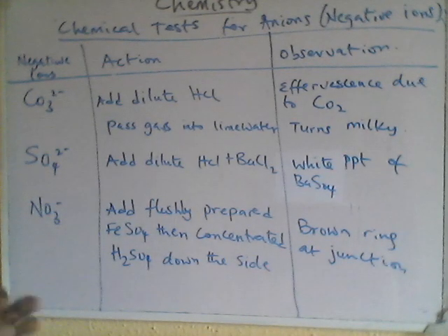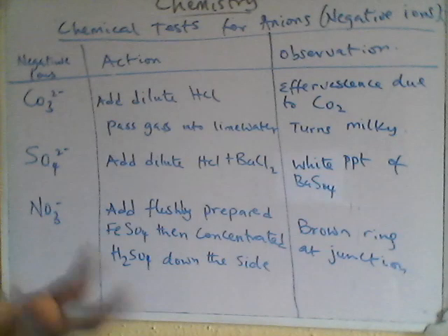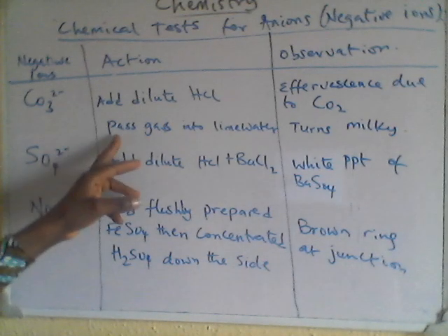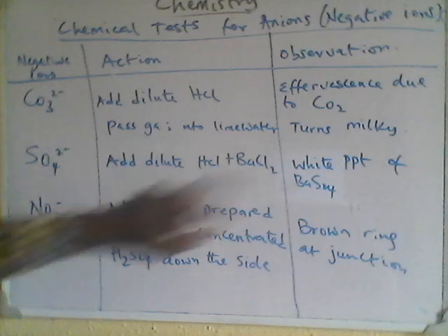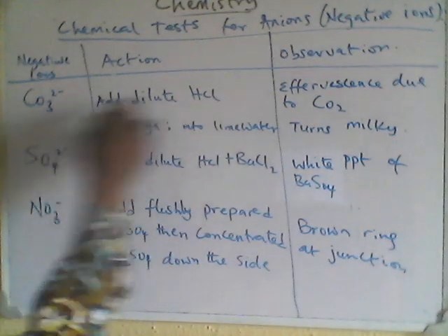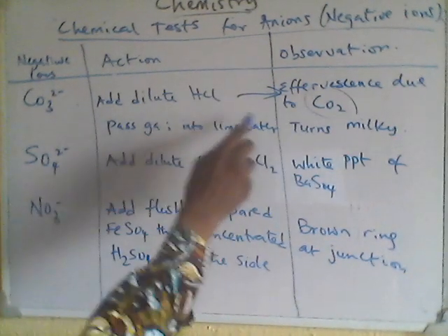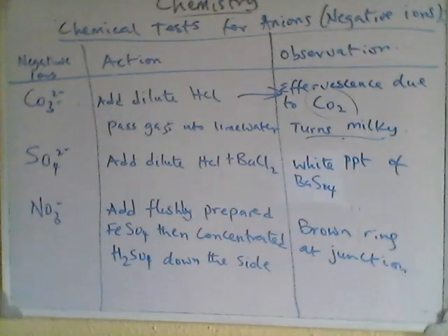Effervescence is like a bubbling sound. Okay, so there's effervescence. If again I also pass the gas into lime water, it turns it milky. So look, there are 2 things I'm doing here. The first thing, if I add dilute acid to this, I get this. Then this gas, if I pass this gas through lime water, it turns milky. It shows that carbonate is present.